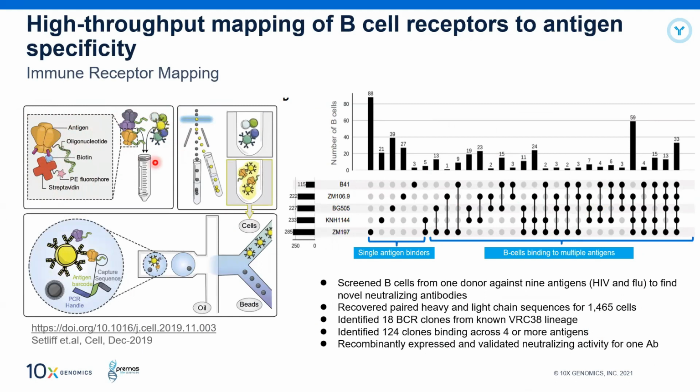This is incubated with the B cell population that are expressing different antibodies, and then you can see they are added to the staining method we have done, and based on the PE, or phycoerythrin, fluoroprobe, we are sorting those populations. Ultimately this is taken as an input in the 10x workflow, and you are able to capture two data types.